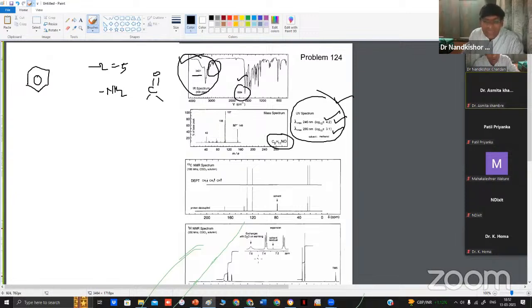In the proton magnetic resonance, you can see here, this is a doublet and this is a doublet. So that means there is a presence of a para-disubstituted pattern. So this aromatic ring is again para-disubstituted. Now here, this hump belongs to the nitrogen stretch, that is the NH2 peak, which exchanges with D2O. So there is a possibility that the NH2 group is free, and will not be part of the aromatic ring or part of an amide. So the NH2 amino group is free over here in this structure.